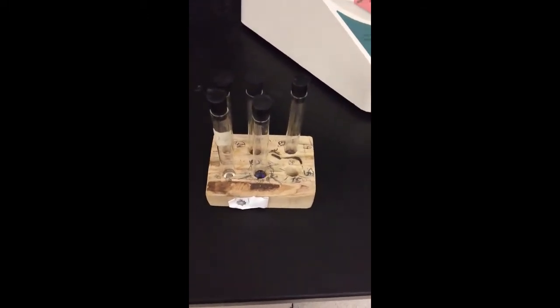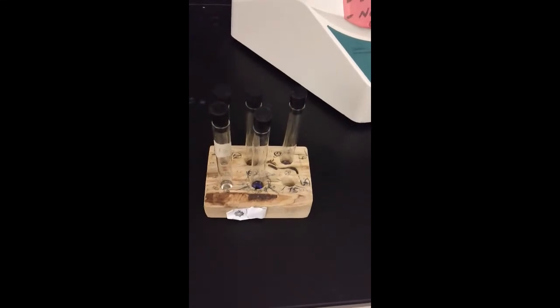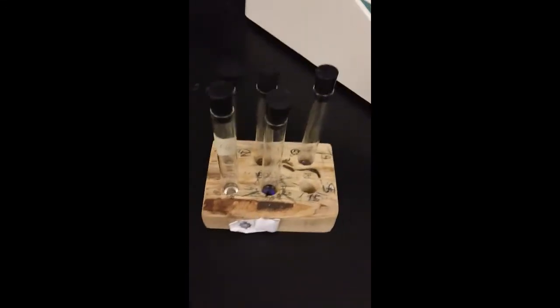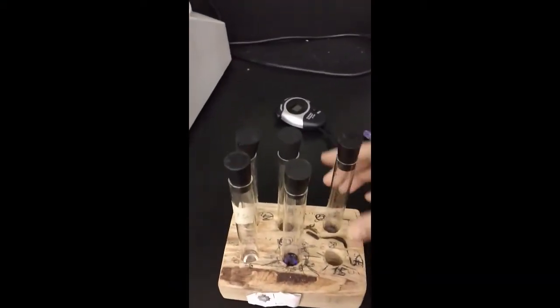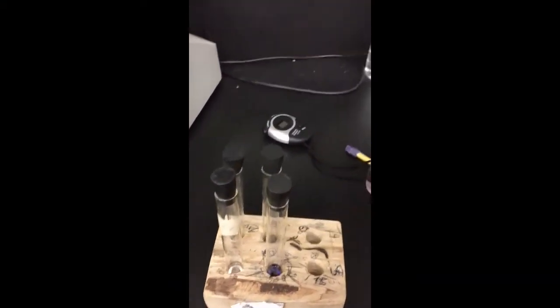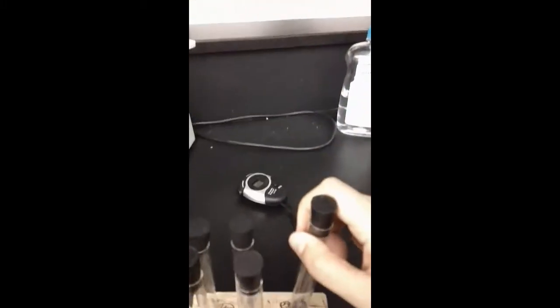All right, so yesterday where we finished is we got done with test B and the first part of it, so we were able to mix all of our chemicals together. Okay, so now we're going to be at the centrifuging part because we're checking for solids, and we call solids precipitates. So first here we have our Cr. This is what it looks like before centrifuging. Notice the bottom, there is a solid or a precipitate forming.